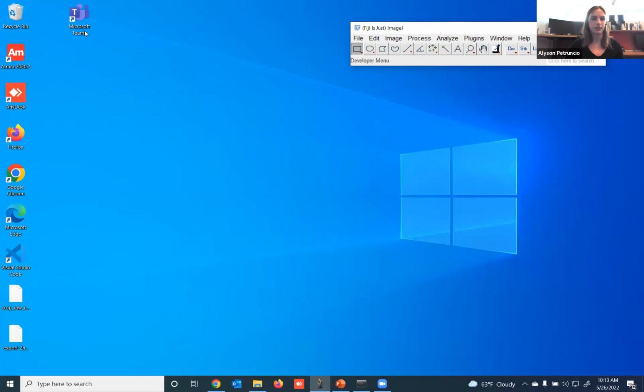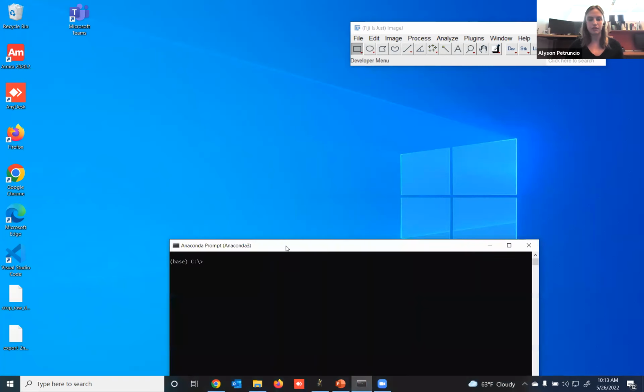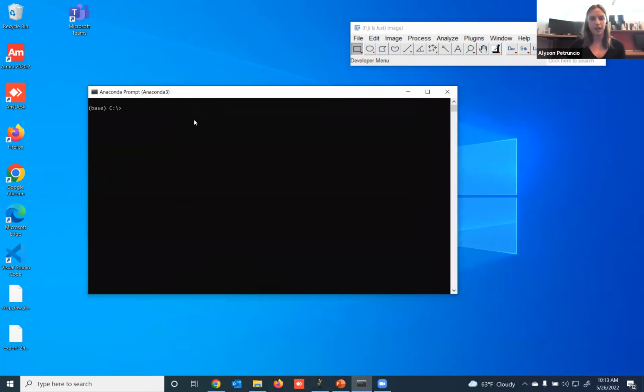All right, so first what I'm going to do is bring up an empty Anaconda prompt. And first, what we want to do before we install Paintera is create an environment. So I'm going to create an environment called Paintera test.